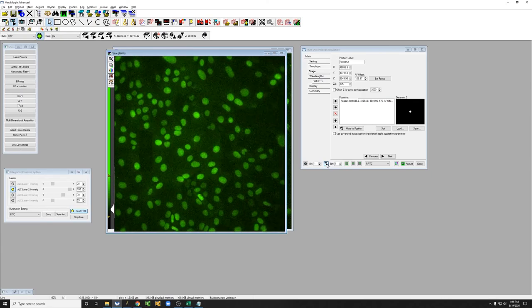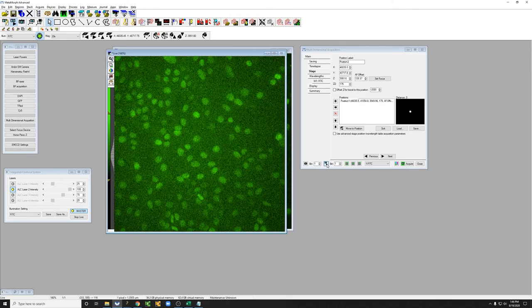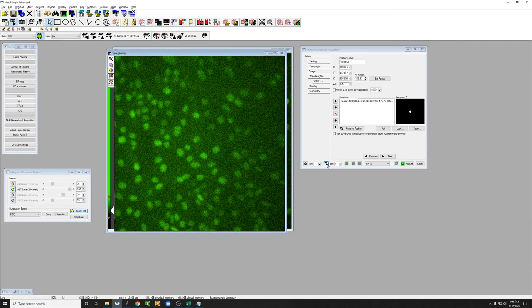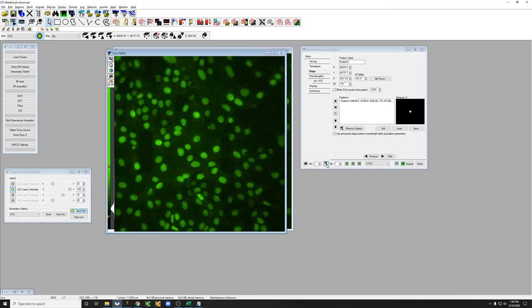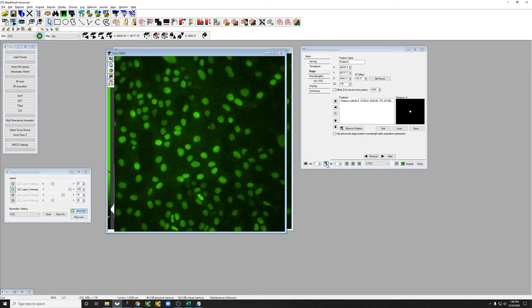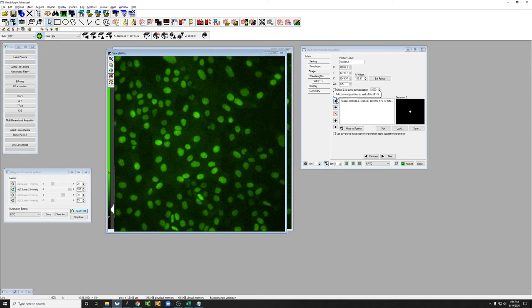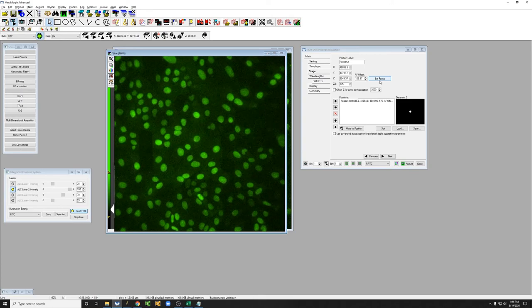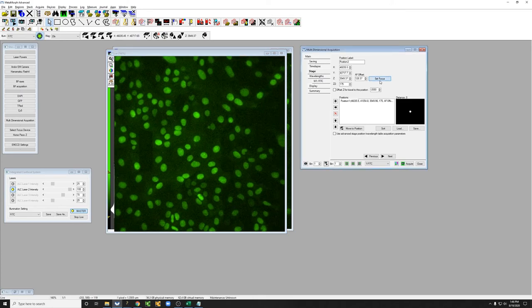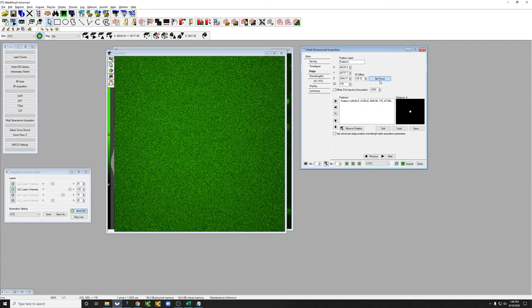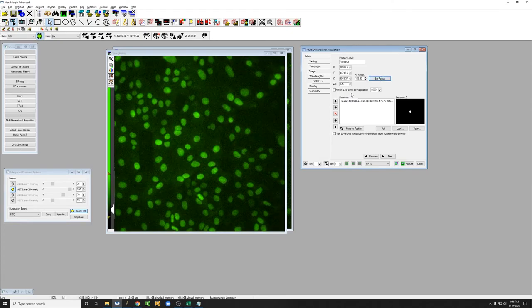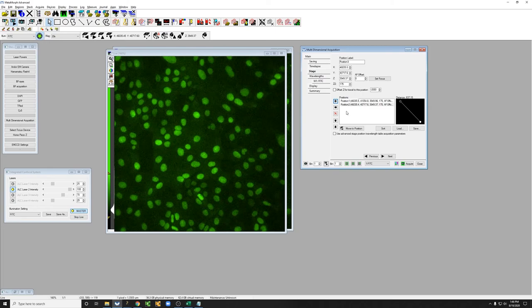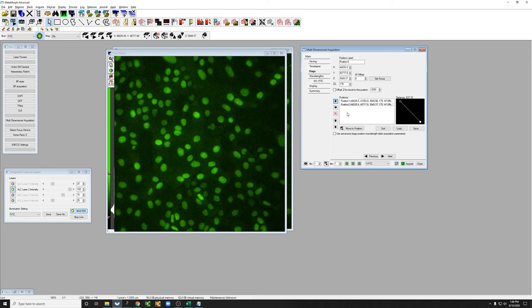I'm going to adjust the focus manually on the focus knob. And before I add another position, since I also want to do autofocus on this one, I'm going to click on set focus and then add it. So then it'll have the proper autofocus offset for this position.